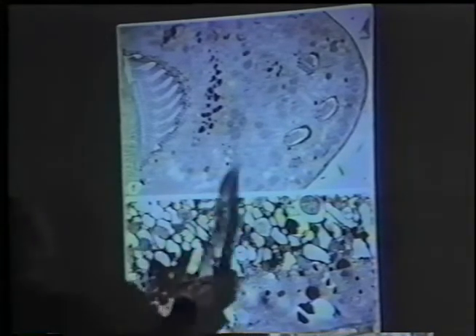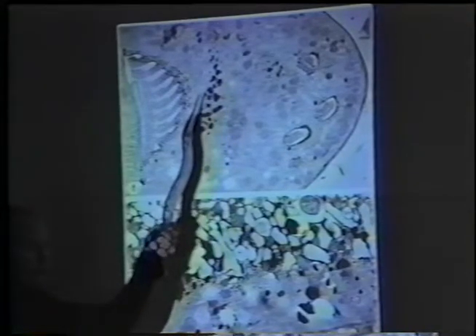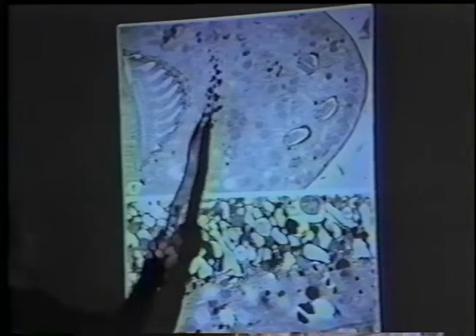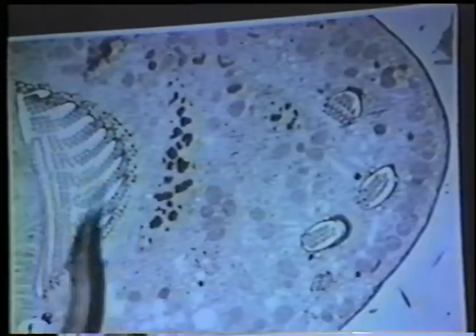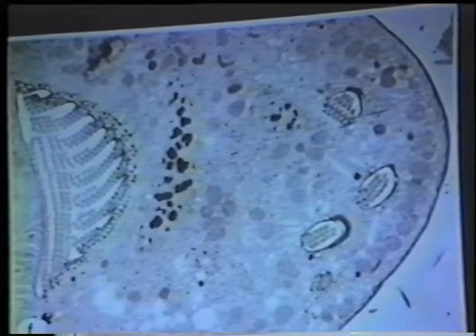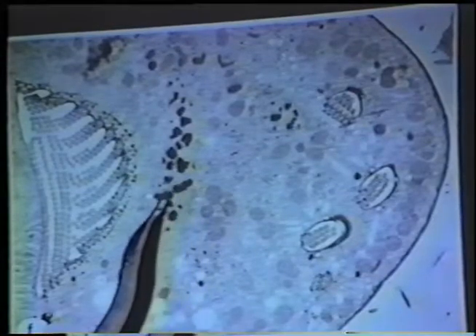You can see that the cytoplasm has been very nicely preserved. One of the most difficult organelles to preserve well is the nucleus. And there's very slight arborization of the chromatin in the nucleus in this sample. Everything else looks good. Now, I do have samples of these cells in which the chromatin is well preserved, but they don't have a nice oral region right next to them like this, showing the preservation of the ciliary arrays, the oral region. And these are cirri, which the beast uses to crawl, if you want to think of the beast as crawling. Okay. This cell was well preserved.